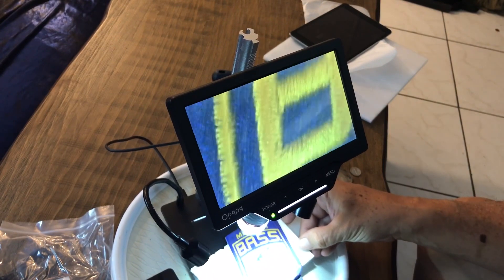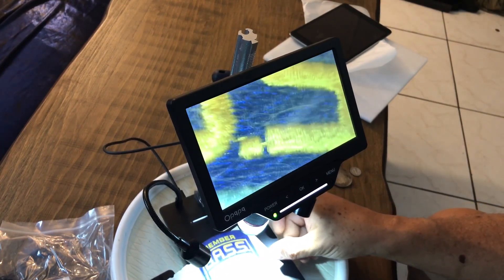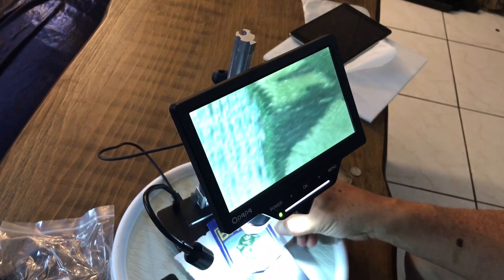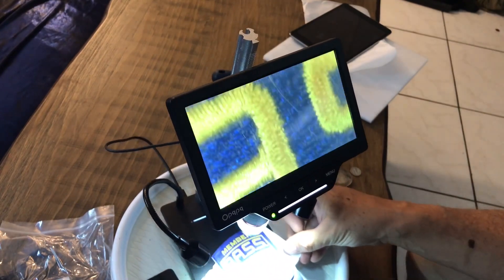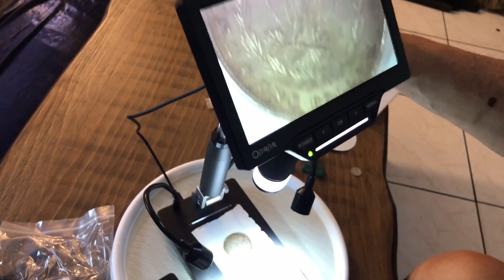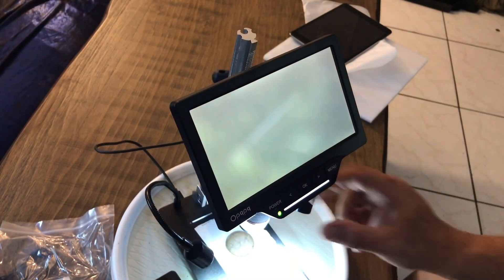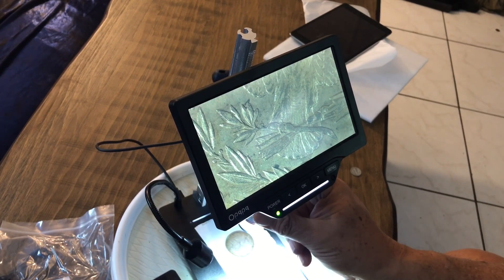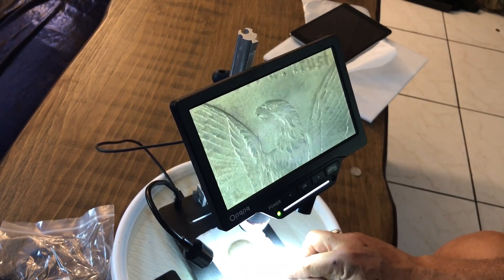Here's a patch I've had for a number of years. Now look at the embroidery stitchery on it — it's kind of neat. And the cat hairs stuck to it! The ability to record video natively in here is kind of nice — it'll save you a bunch of wear and tear on your camera. Pretty flexible too. I really like the travel on this arm and the fact that it's got an extender so you can really get where you need to be. If something's really tall, you could put it under the microscope and still focus on it. It's neat that it does such a long focus.